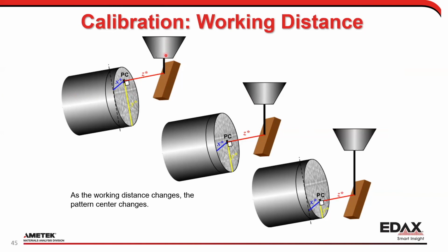And here we can see my pole piece. If your pole piece moves, you have a big problem. If your pole piece moves, let's go ahead and call service and say, oops, something bad happened. But here again, it's really a question of, is my detector in all the way? With Apex, we added the ability to change this a little bit, where I can say, hey, my detector is not always in all the way, let me go ahead and use a different calibration.